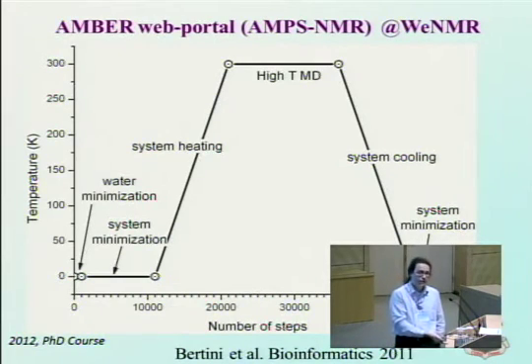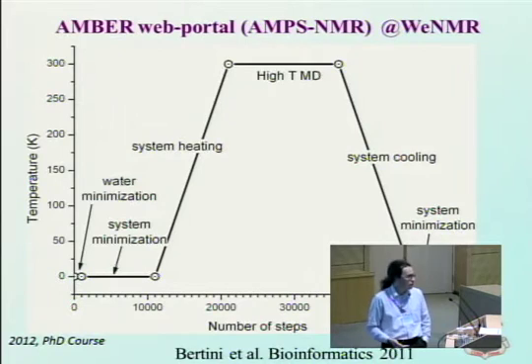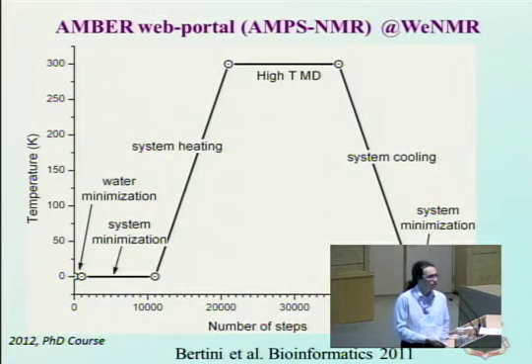This is another limitation of the normal structure calculation algorithms: they do not include the solvent, because if you have to put many molecules of solvent there, this is going to slow down your calculations. So what we do is we take the structure, or the bundle of structures, that is being produced by the structure generation program and the restraints, of course.